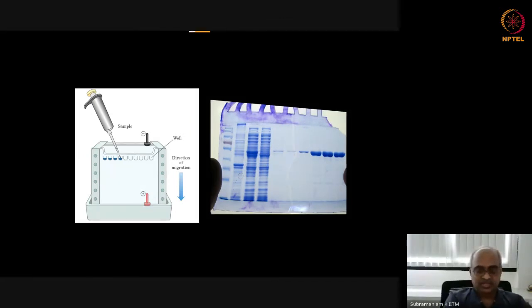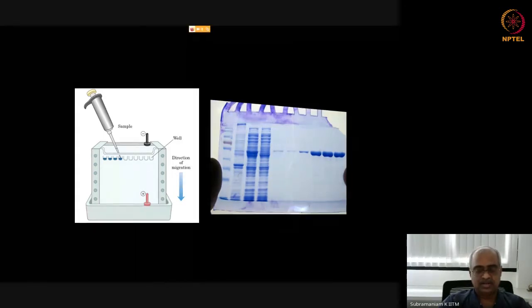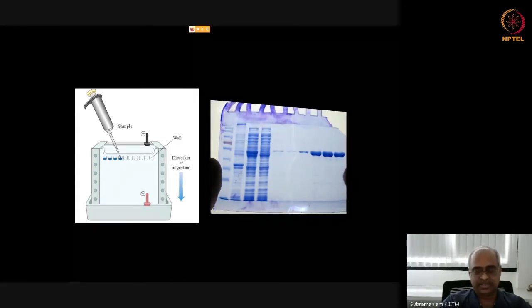Normally for agarose gel, which is the easiest to make, essentially, you measure out a certain amount of agarose powder. You add it into a buffer, which is primarily water, but you need charged molecules to conduct electric current, and therefore you have a buffer there, like Tris acetate EDTA.